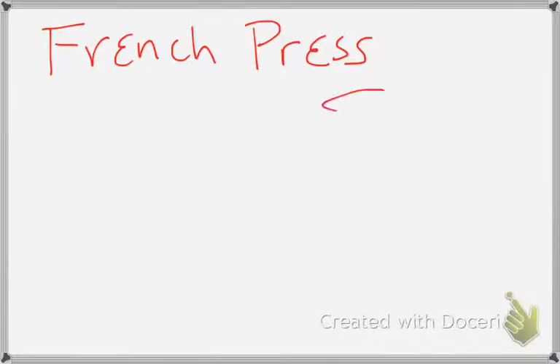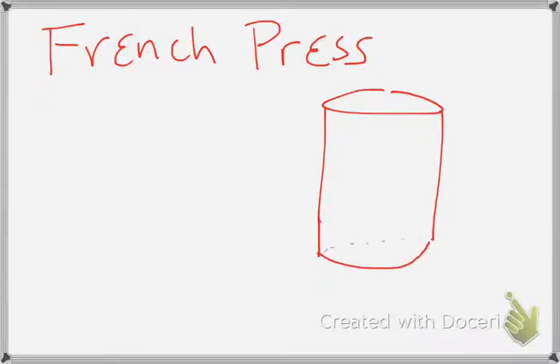And they've got this thing that kind of looks like a piston. Like it's a big, metal beaker looking thing. But in the bottom of it is a really, really tiny little hole. Whoops, I can't even do it with that. Just a little hole. Here, let me use a different color. There we go. It comes up.